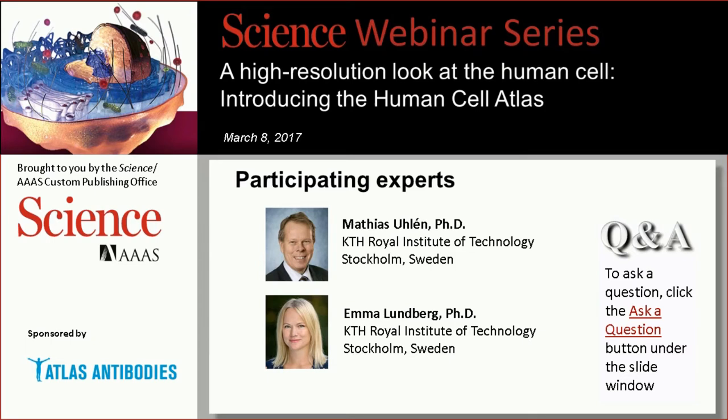Okay. Dr. Uhlén, you talked about antibody validation in your presentation. Have all of the antibodies used in the cell atlas been validated? And if so, how is this shown?